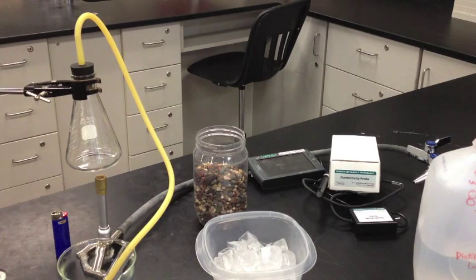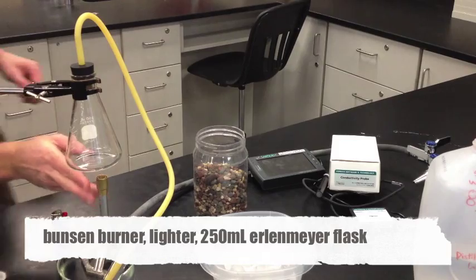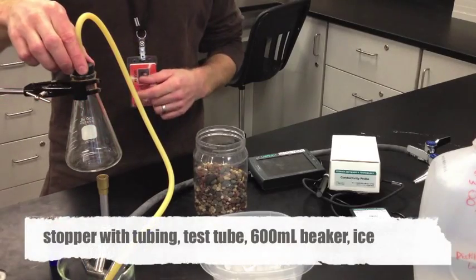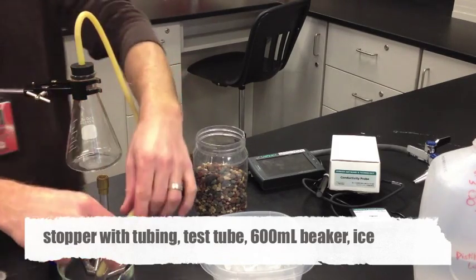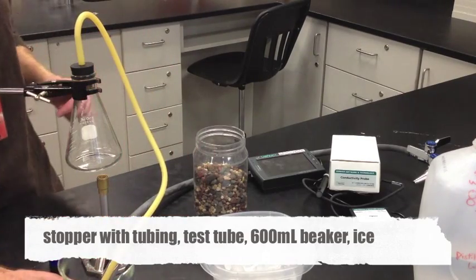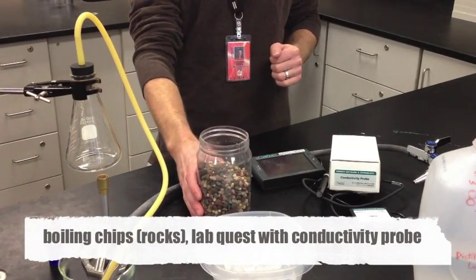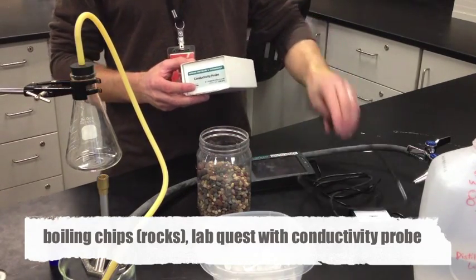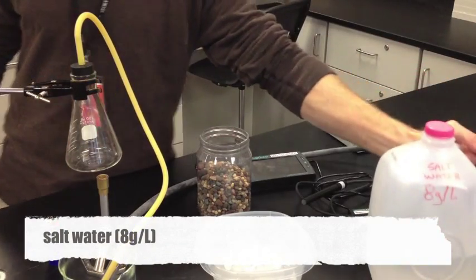The process of distillation is very energy intense. We're going to need a Bunsen burner and a lighter for this lab. You'll need a 250 milliliter Erlenmeyer flask with a rubber stopper and a tube coming out of it to collect the steam, and a test tube to condense the steam into liquid water. You'll also need a 600 milliliter beaker, some ice, a couple of boiling chips or rocks, a LabQuest device, and a conductivity probe to measure how much salt is in the water. And of course you'll need saltwater to run this experiment.